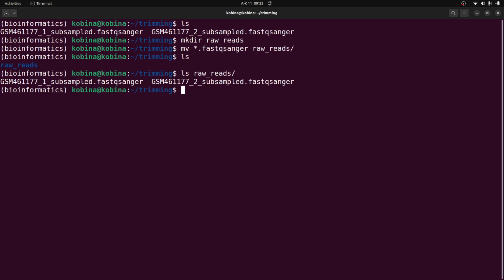It's important we run Fastqc to assess the quality, and then we can now compare to the trimming so that we are all on the same page. So let's first run Fastqc. It's always important to run Fastqc to assess the quality first. In some situations, when you run it, it will be okay, so you don't need to do further processing. In some cases, you run it and it needs further processing. For the context of this tutorial, we are only going to compare before and after trimming. So that's why we are running Fastqc.